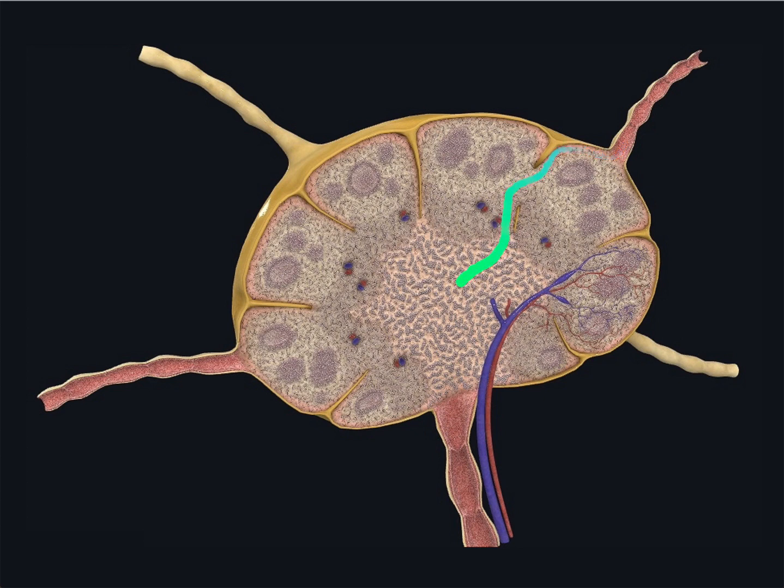As the lymph passes through the sinuses of the lymph node, flow is slowed by the meshwork of reticular cells and supporting reticular fibres, and so foreign substances or antigens are captured by follicular dendritic cells and dealt with by the various immune cells. The sinuses carrying lymph and lymphocytes converge near the hilum to drain into efferent lymphatic vessels.